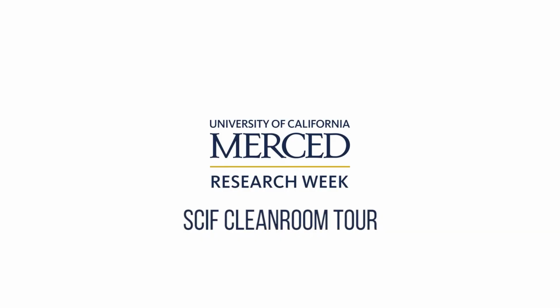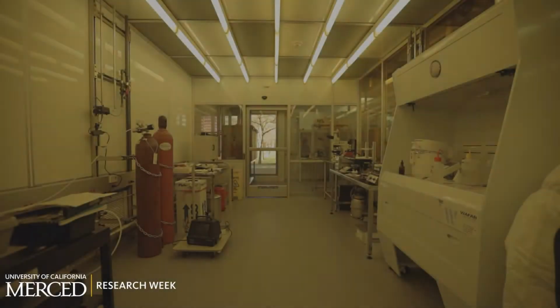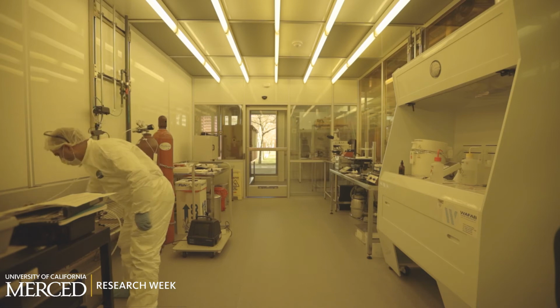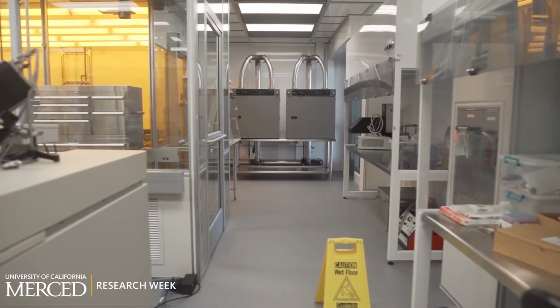In this tour, you will explore the cleanroom core of the stem cell instrumentation foundry. So, what is a cleanroom and what's the purpose of one? A cleanroom is a controlled environment where pollutants like dust, airborne microbes, and aerosol particles are filtered out in order to provide the cleanest area possible.